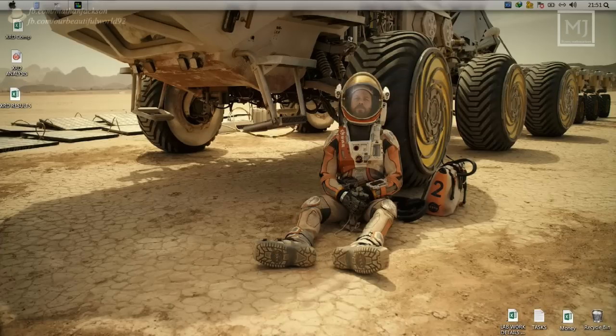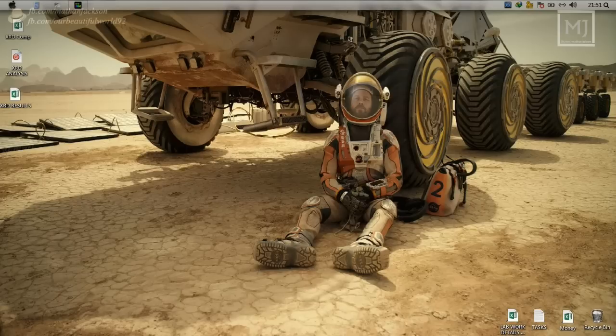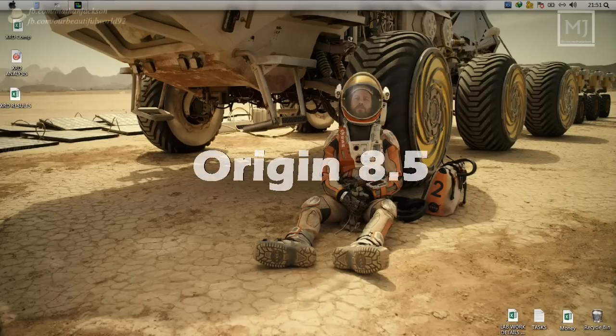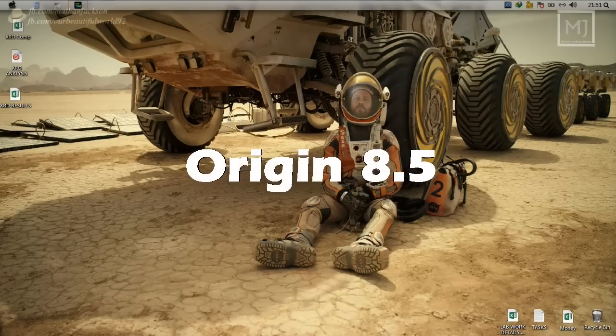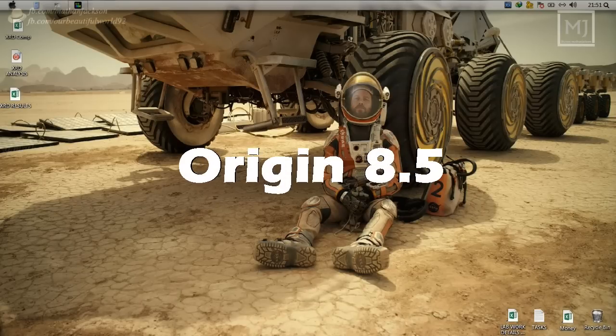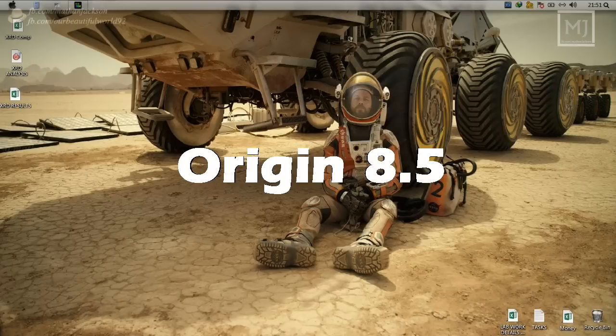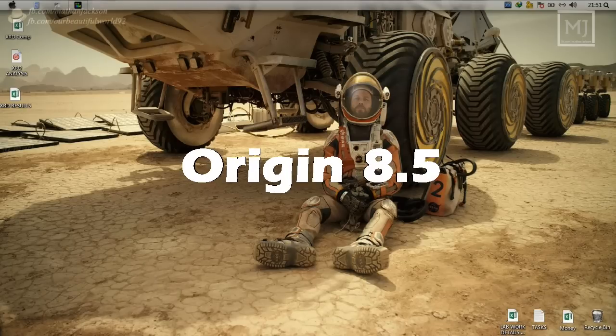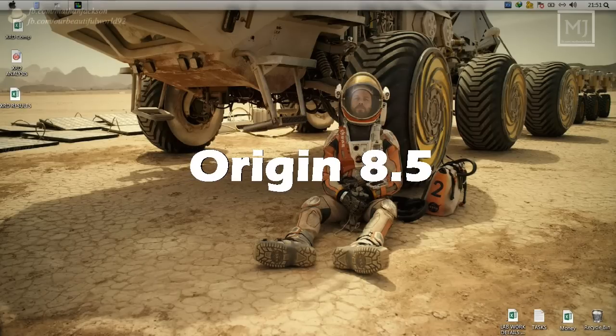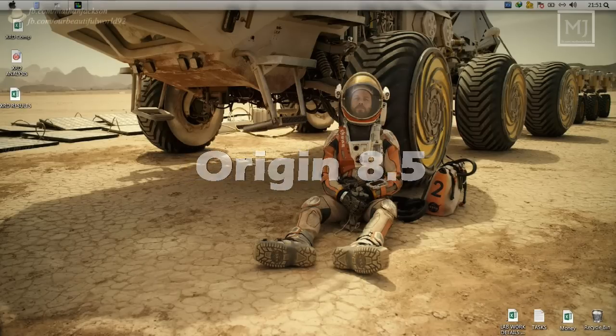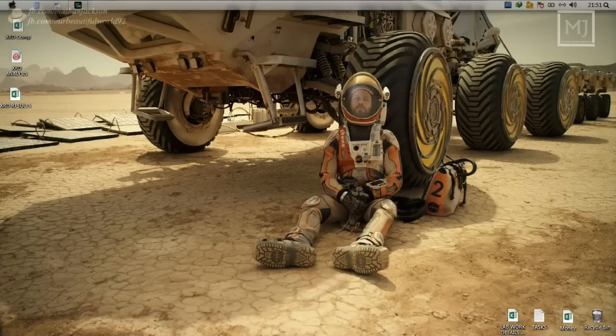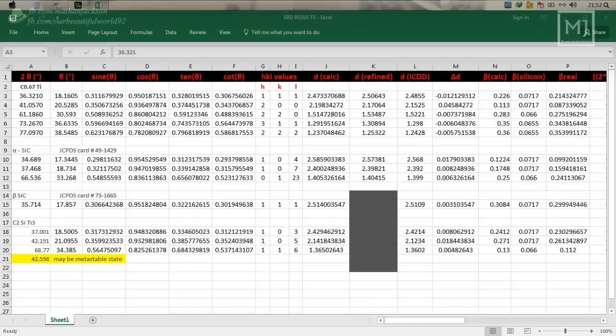In this tutorial I'm gonna guide you how to do XRD analysis using my workspace template using Origin. Please note that this template will work in Origin 8.5 or above versions only, so please take a note of it.